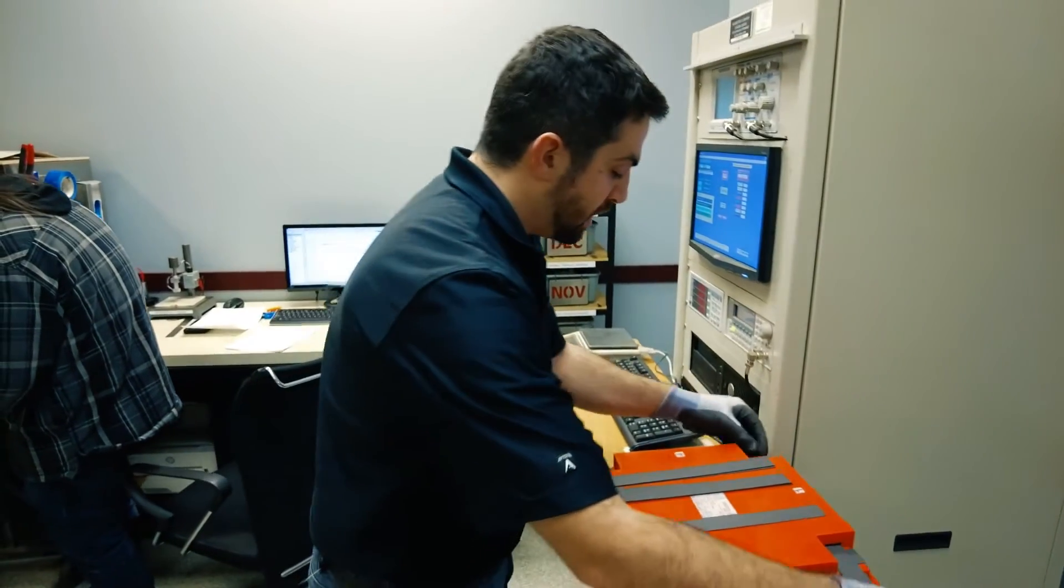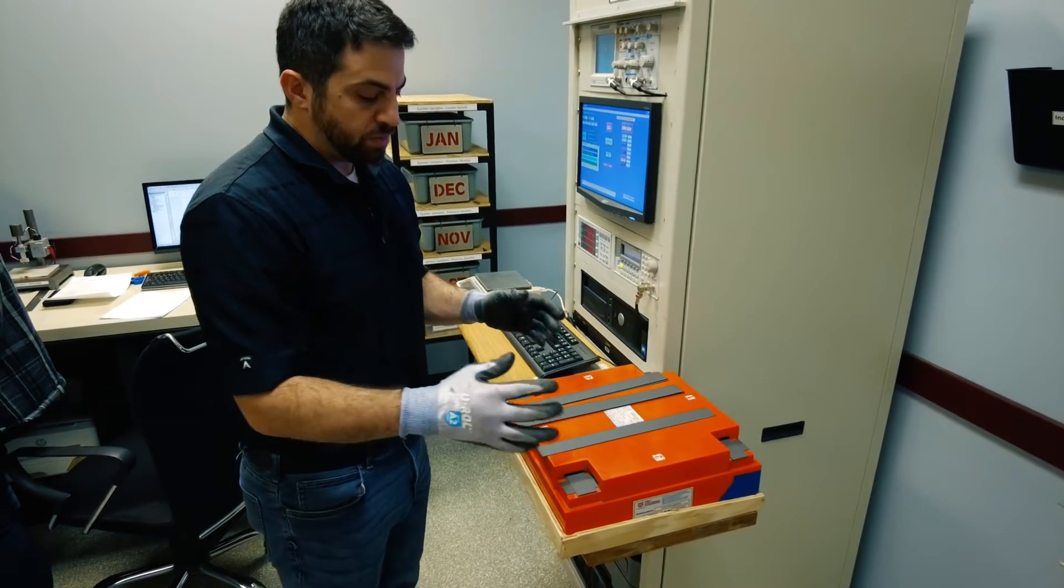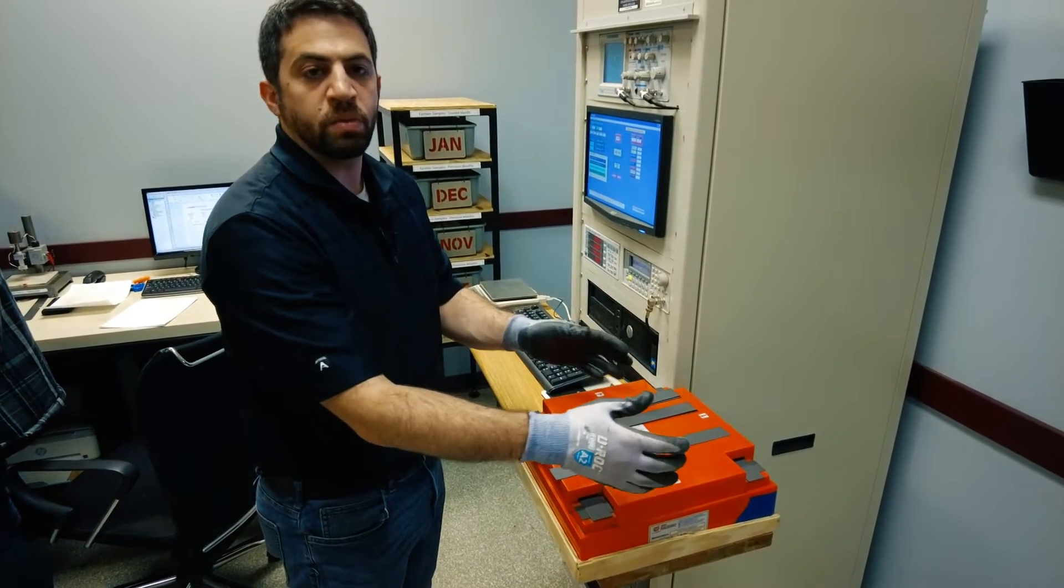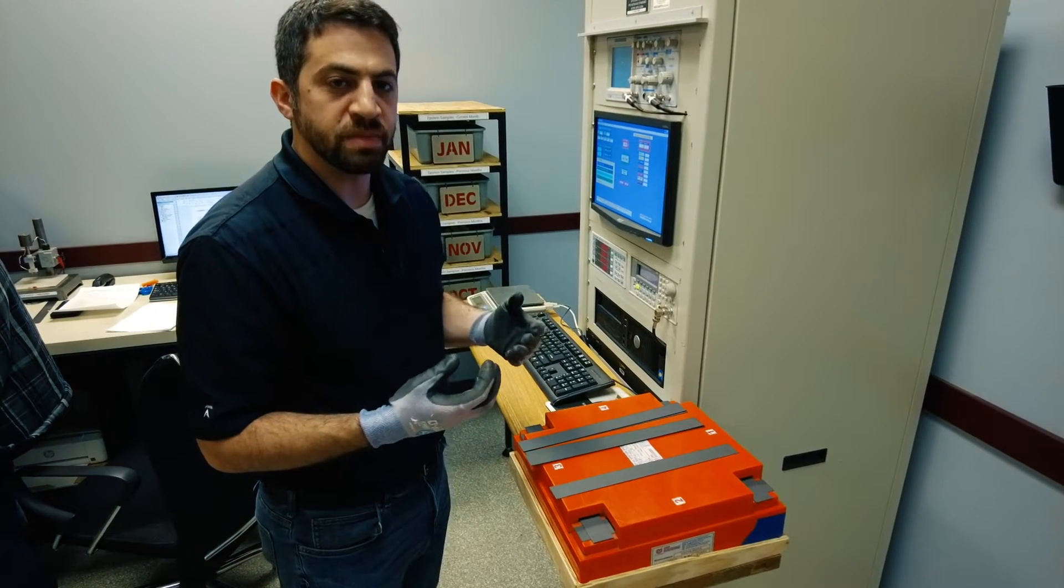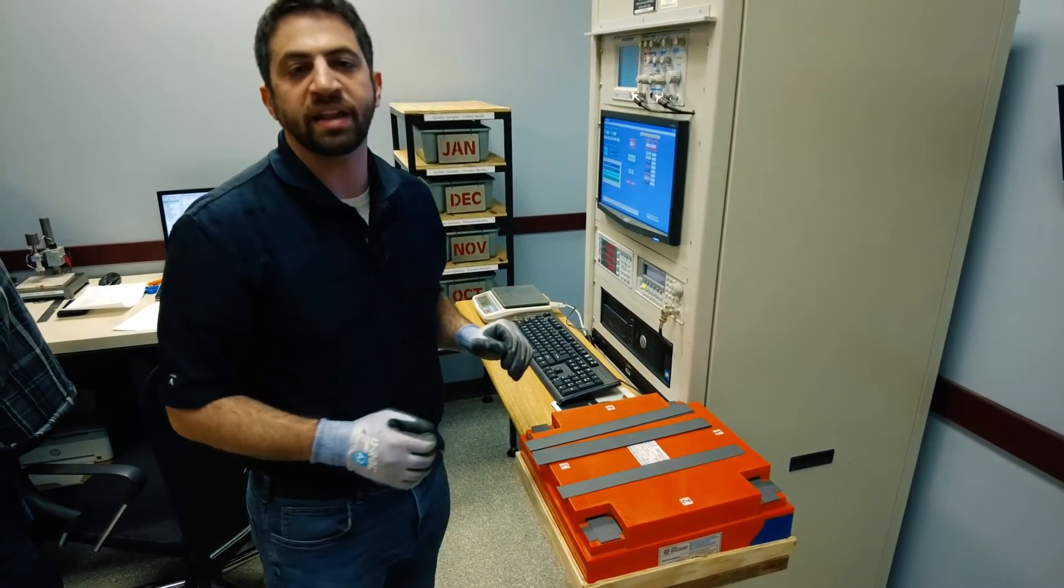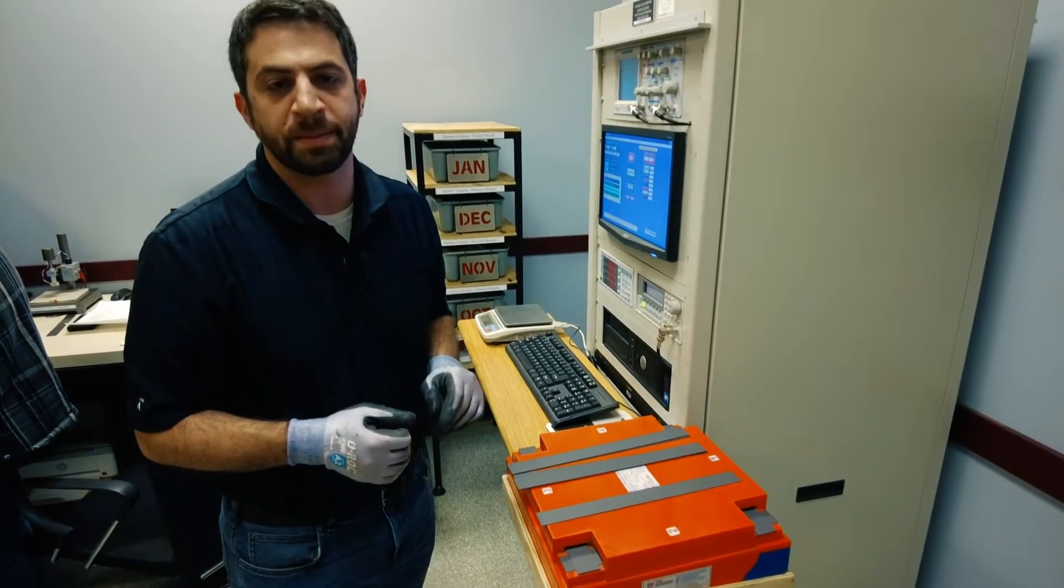what frequency, and exciting it to certain power and current. Then there'll be a receiving end where we'll be receiving what power and current we measure, and with the mass that I'd already weighed, that allows us to tell both the core loss, permeability, and a few other magnetic properties of the material.